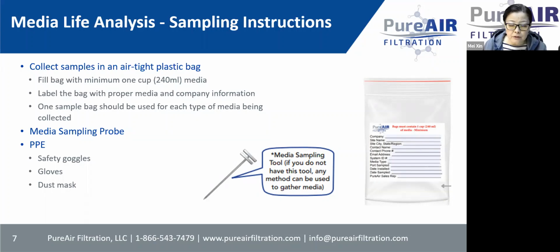Another thing we have to be careful is 1 sample bag should be used for 1 sample only. And so if you have samples, same type of media from different locations, you have to use 1 sample into 1 bag. You don't mix them up.